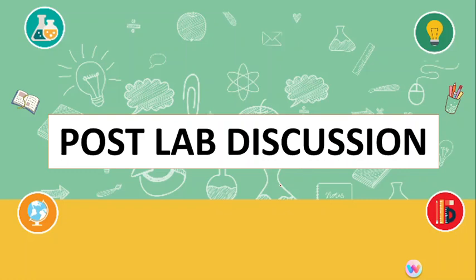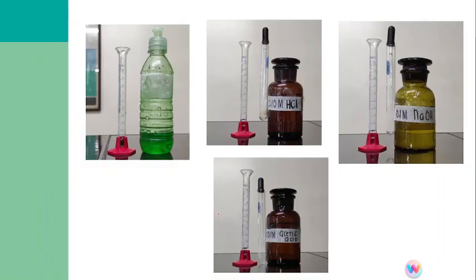Hello class, this is a video recording of our post-lab discussion for your Module 5, pH-POH buffers. To give you a quick review of the chemical solutions that we used in our experiment, here is the dish detergent, hydrochloric acid, and then your sodium hydroxide. Lastly is your acetic acid.